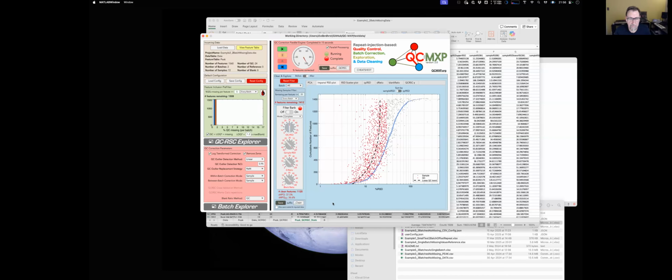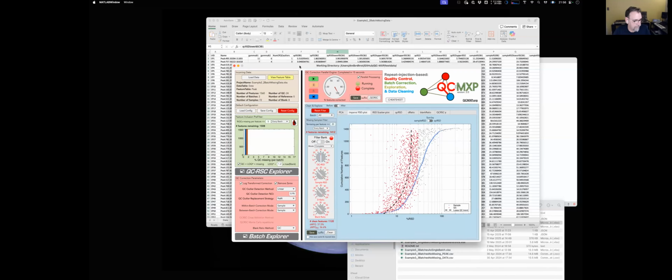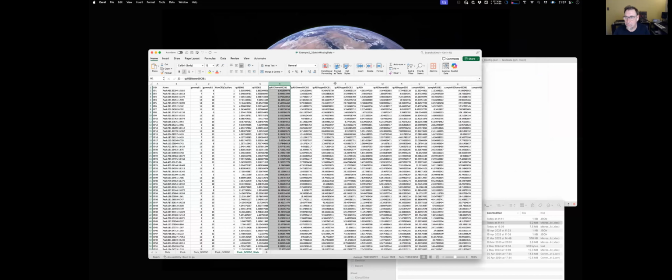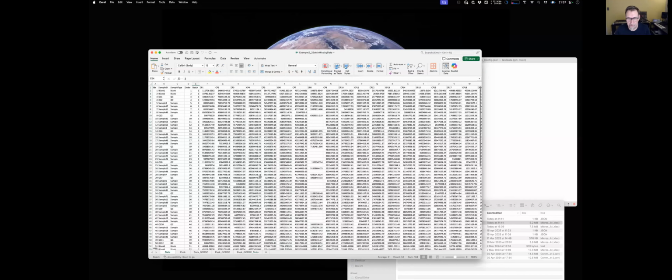Yeah, I mean, often I'm doing small studies. So that study wasn't 10 versus 10, but the Metabolon study was only a single batch. I can't drag it down. No, wrong one. Doesn't matter. The important thing is having enough QCs for it to be usable.